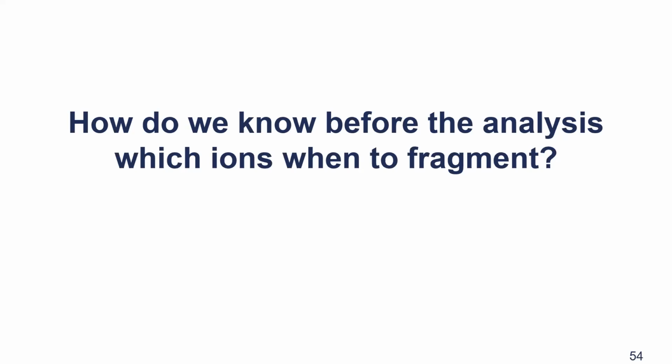I think as of now, most of the data acquisition strategies in non-target metabolomics are built on data-dependent acquisition. Just to get an idea, who of you has used data-dependent acquisition so far? Who uses data-independent acquisition for non-target metabolomics? Okay, so there's an increasing number of users, which is great.